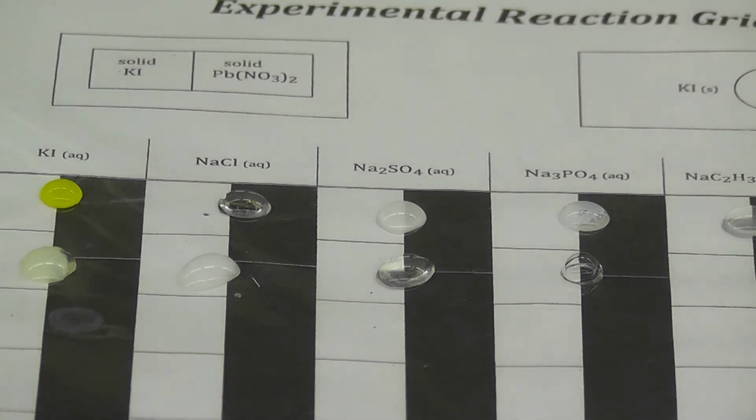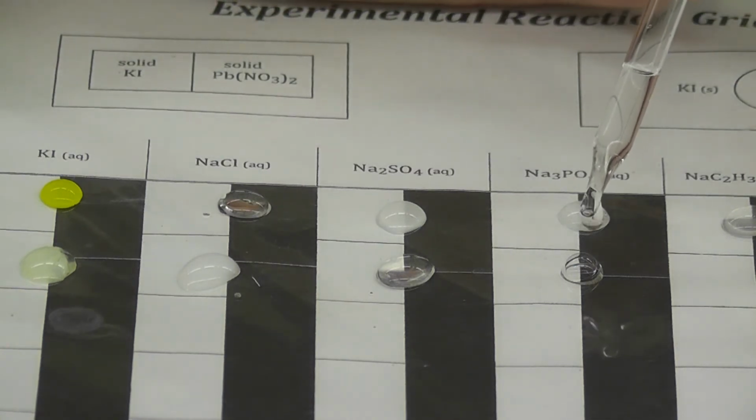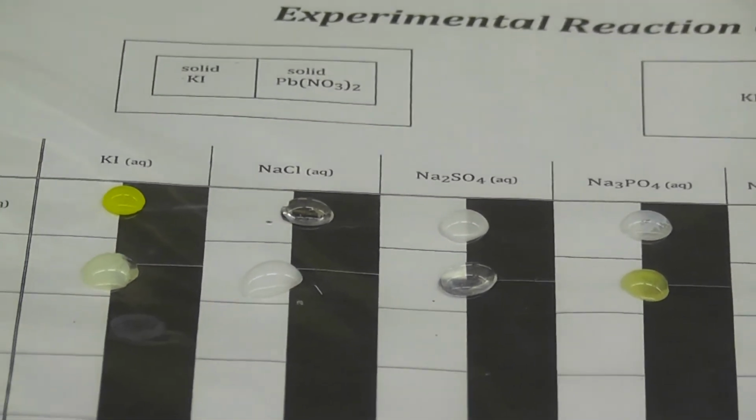And this time we're going to be mixing with sodium phosphate. And 1 drop of sodium phosphate mixed with the silver nitrate gives us that. Okay, a few more to go.